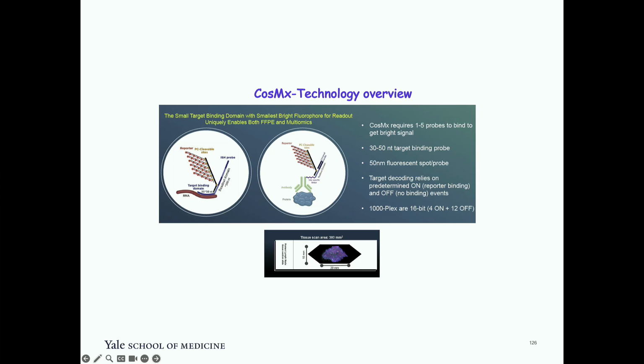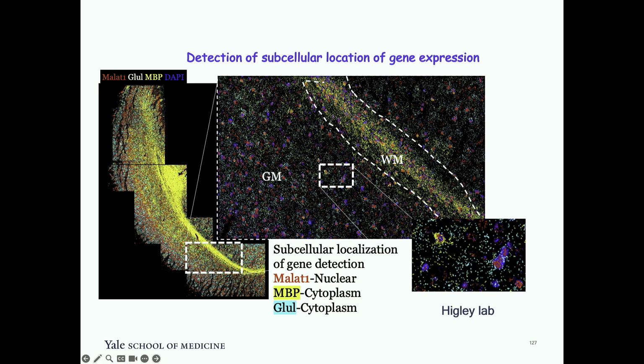So this is called CosMx. CosMx is the only imaging platform at this point which can give you whole transcriptome data. So this is how it works. Again, they have a slide, and in this area you can put as many samples as you want, and you can see localization of genes at subcellular levels also, because they are using DAPI. There is another idea in spatial technology called segmentation. Cell segmentation is a very challenging problem in spatial technologies.